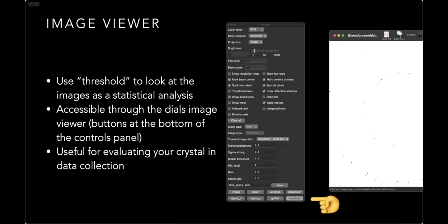And it's not a question, but more of a comment. SBGrid has a data repository that has a relatively large number of diffraction data sets. And I can't think of a single time that we've reprocessed one of those with xia2 and DIALS and had a problem like, oh, we don't recognize it, there's something wrong with the detector class detection. It basically never happens. For the main instruments people would use for structural biology, it's normally fine.